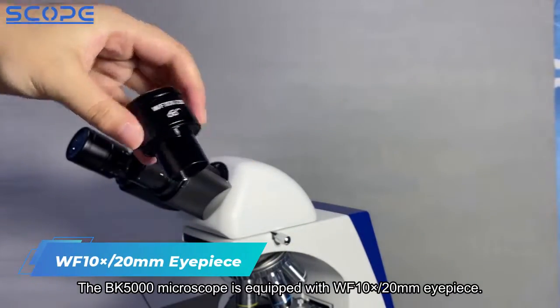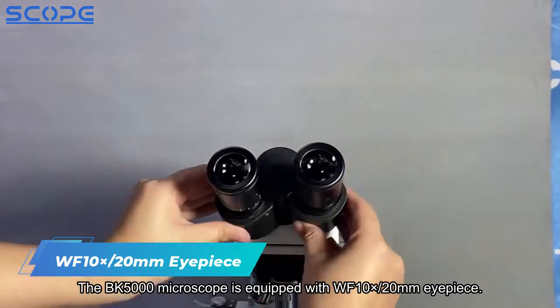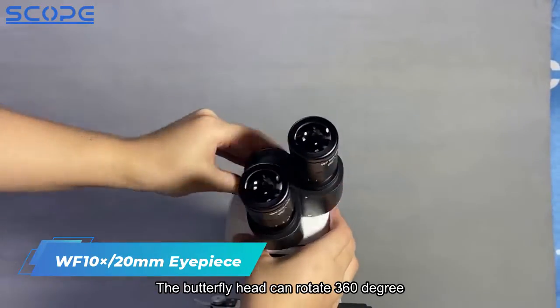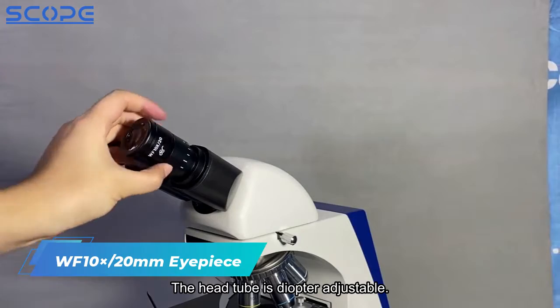The BK5000 Microscope is equipped with WF 10x, 20mm eyepiece. They are high eye point. The butterfly head can rotate 360 degrees. The head tube is diopter adjustable.